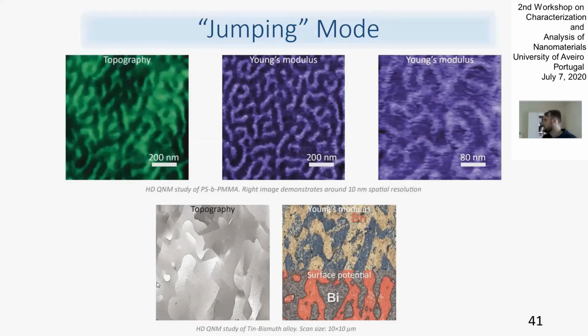So actually, this third mode is the most powerful because you very carefully control forces and you exclude any lateral interaction with the surface. This is also very important because if your tip interacts quickly with the sample, using fast withdrawing and approaching, you don't apply any lateral force, and you can really work with very soft materials like nano objects. You will not move them by the tip motion, which usually happens in both contact mode and tapping mode.